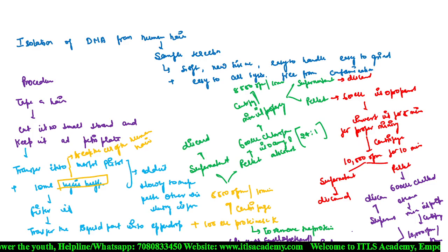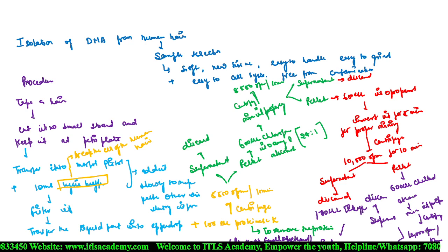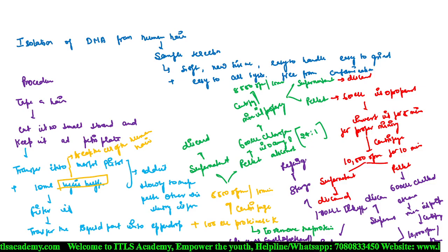And after that, you have to add 100 microliter of TE buffer for storage purpose. Then refrigerate it. Clear?